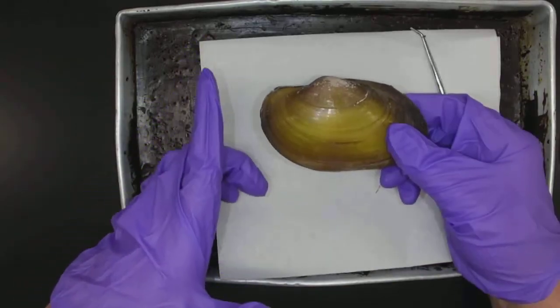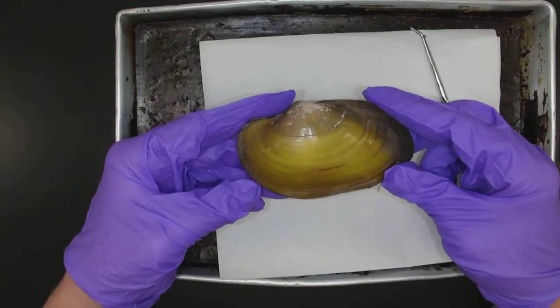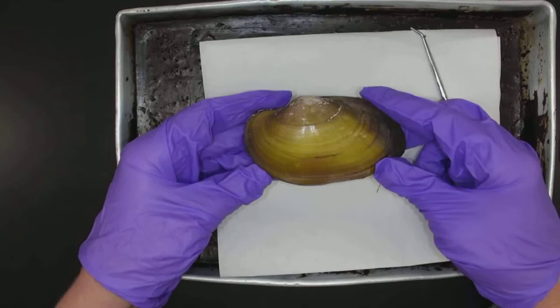Not as easy to tell are the anterior and posterior ends. It kind of depends on the species of clam. Sometimes it's easy, sometimes it's harder. It's easier once you get inside.